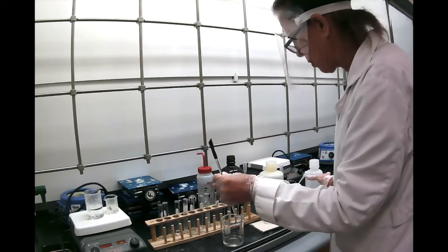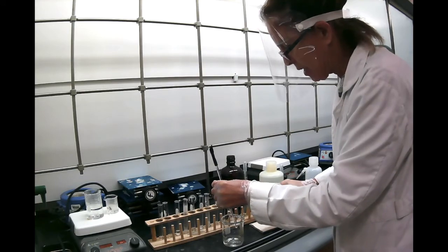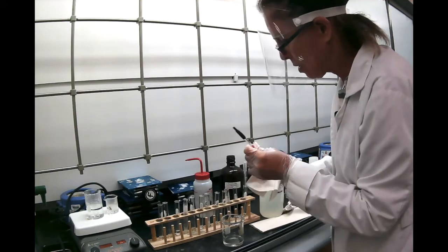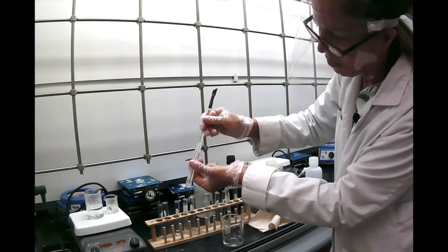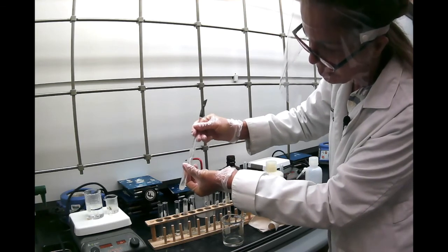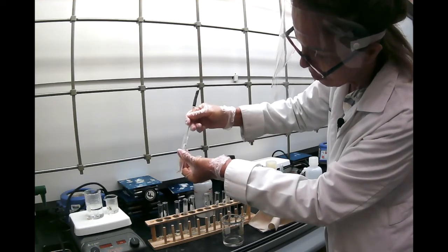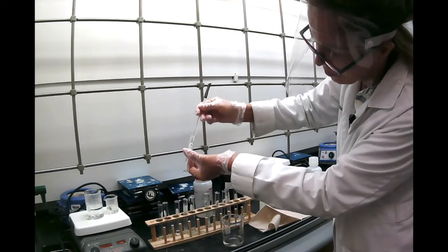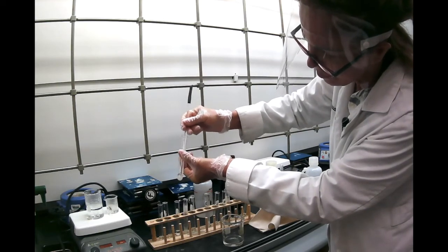Now we're going to go to the next substance, which is naphthalene, and see if it dissolves in cold petroleum ether. So this is naphthalene in petroleum ether. So it's not very soluble, or maybe it is. Let's keep stirring and see what happens. It's a lot more soluble than in the previous solvents.